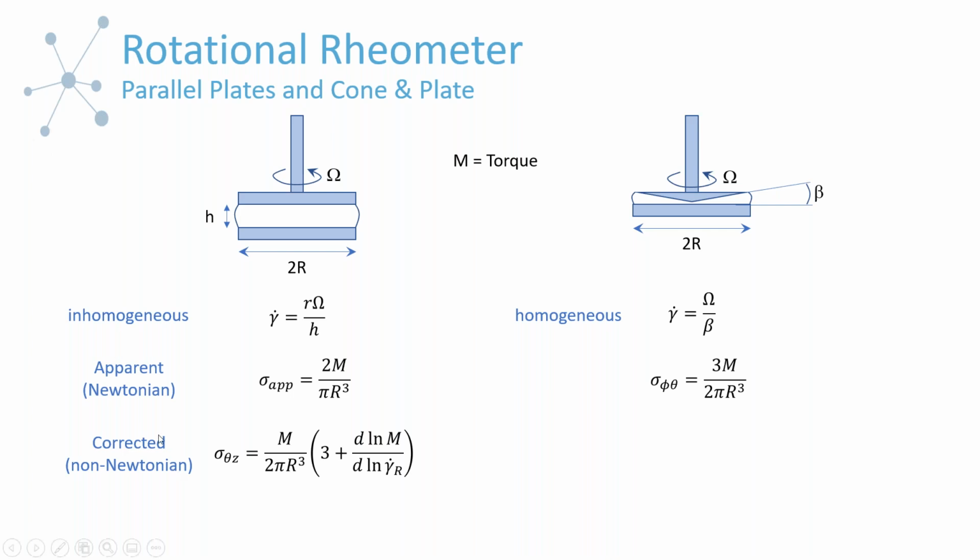You're really controlling angular displacement, and then using the tool geometry and your gap fluid height to calculate the shear rate. And then from the torque and again the geometry of the tool, you're calculating shear stress. So everything is calculated, generally in this multi-step process. This is where all the instrumentation is on equal footing, in that this is a calculated property.